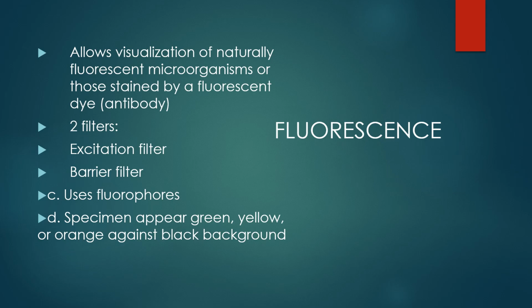It uses fluorophores to stain your sample. In the image, the specimen will appear green, yellow, or orange against a black background based on the fluorophore that is used.